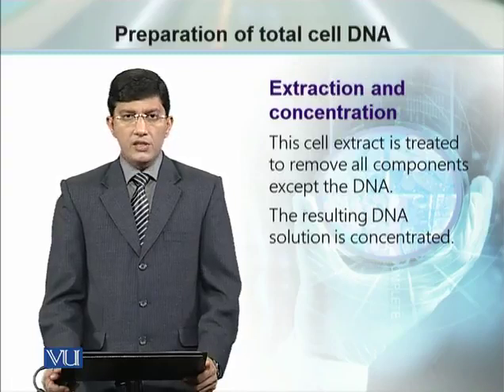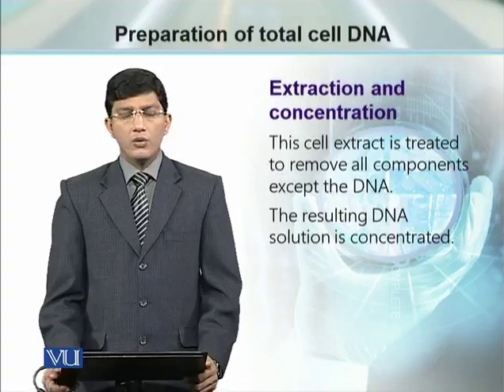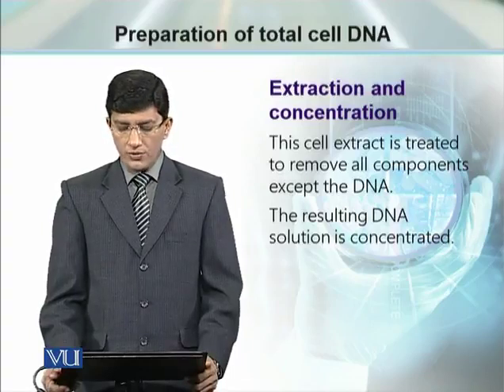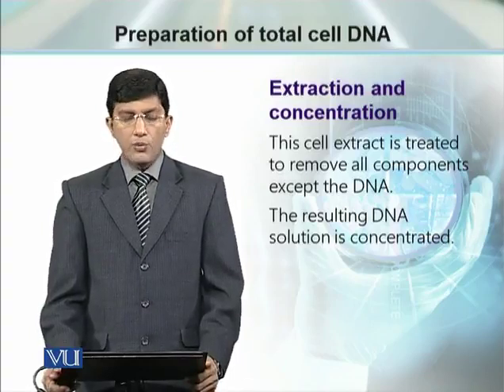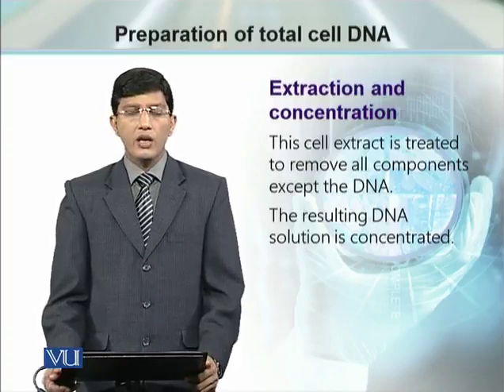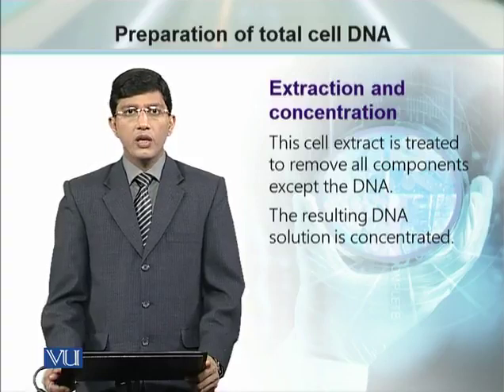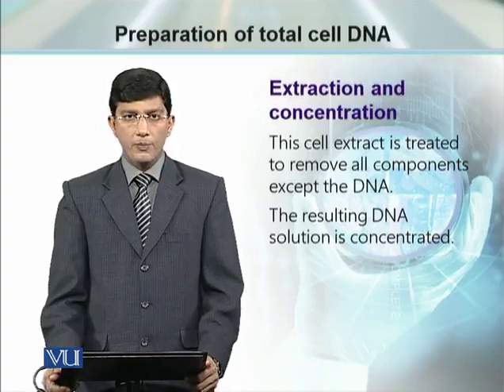The treated cells or the ruptured cells are going to be processed further so that we remove all the components except the DNA. Once we isolate the DNA from the rest of the debris, cellular debris or any cellular components, we can further concentrate it and we can obtain the purified DNA.